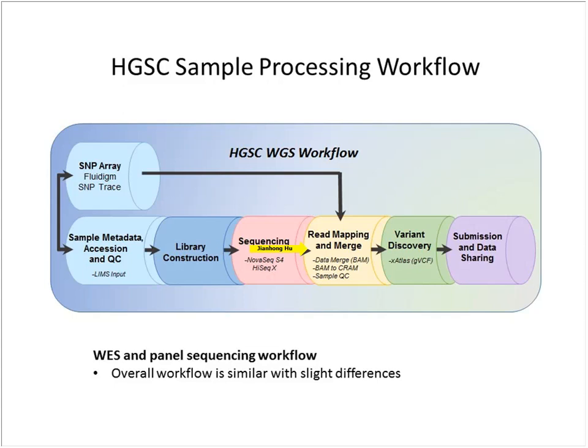At this stage, the SNP array data is integrated again for further analysis to compare the concordance. Only the passing samples are used for the variant call and the subsequent data submission and sharing. For clinical samples, there are additional steps for the report generation. So in general, whole exome sequencing or panel sequencing have a very similar workflow, but with just minor modifications.